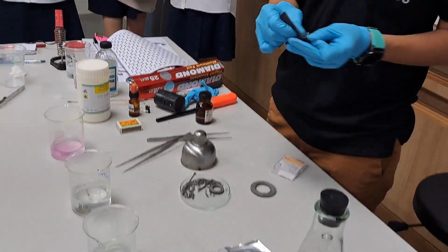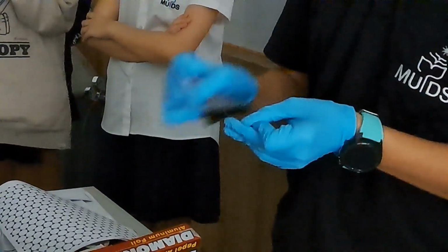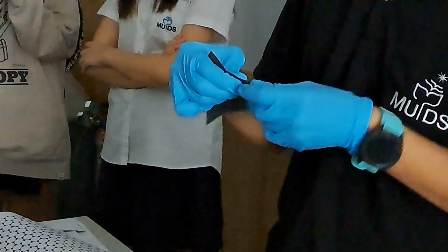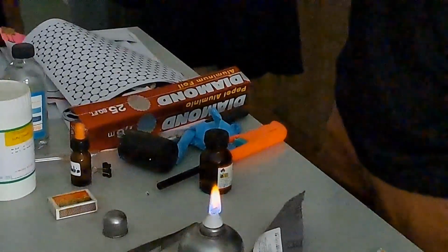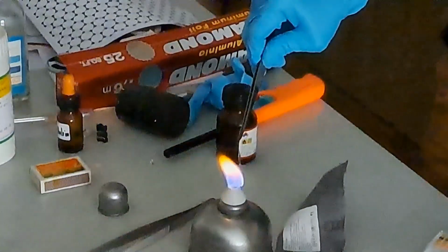Need the right filter. Wait, on my mark, everyone say Lumos. You will see there will be sparks before it starts to burn.